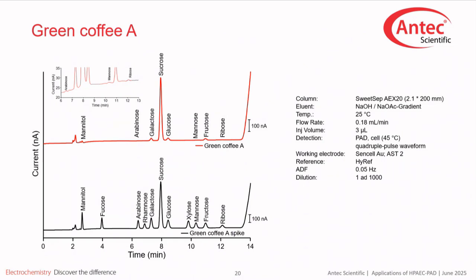carbohydrate composition. During application development, we were even able, based on the limits set by the AOAC and ISO, to identify a coffee that contained a higher than expected concentration of carbohydrates. Thus, HPAEC-PAD serves as a method for detecting and identifying food fraud.